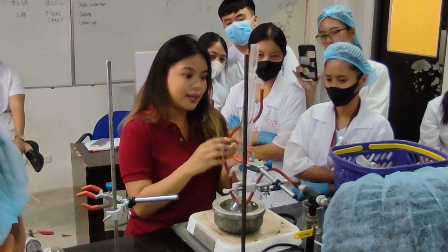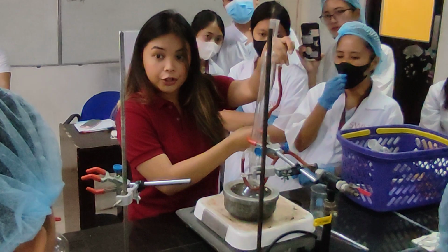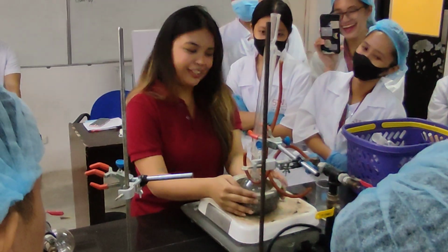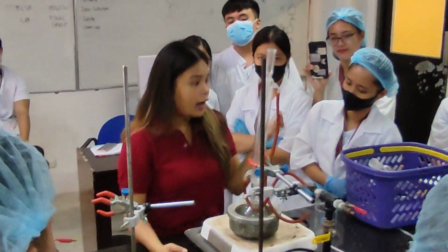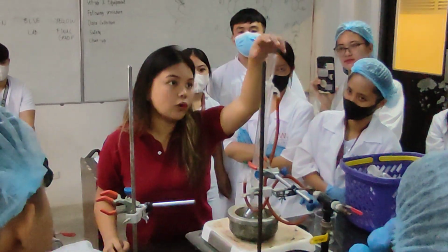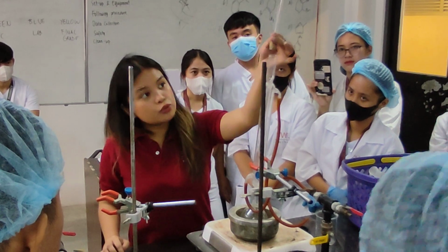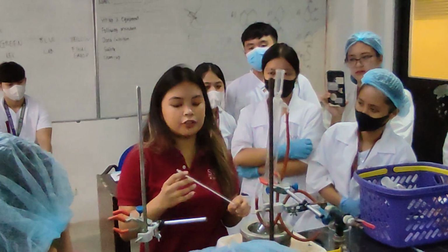So again, those are the parts. This is water in. This is water out. Cold water. Of course, this is your water bath, with water. And then the wire gauze, and then the heat. Now, in some setups you don't need to place a cork or any stopper, because it will put pressure on the heat or on the condenser. Sometimes you place one, but it should be loose. For example, the procedure may be to heat under 50 degrees Celsius.